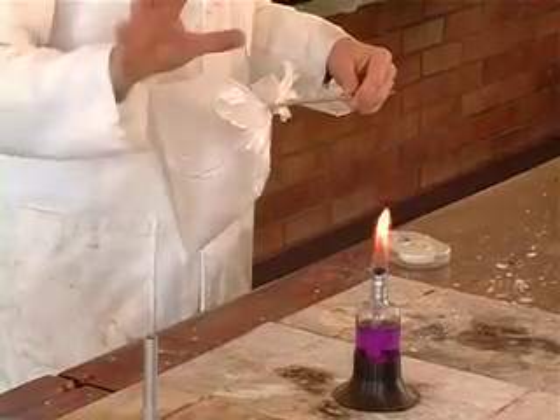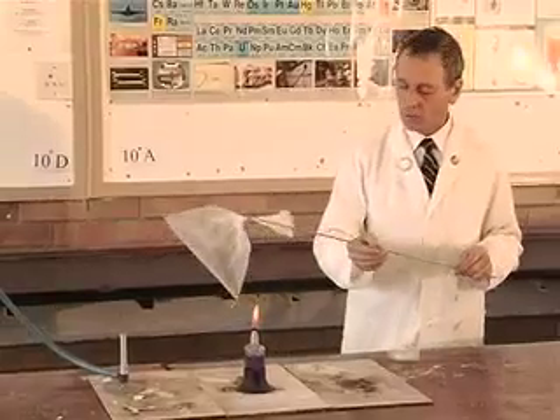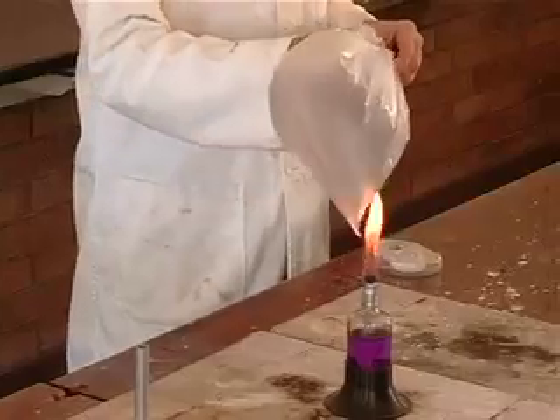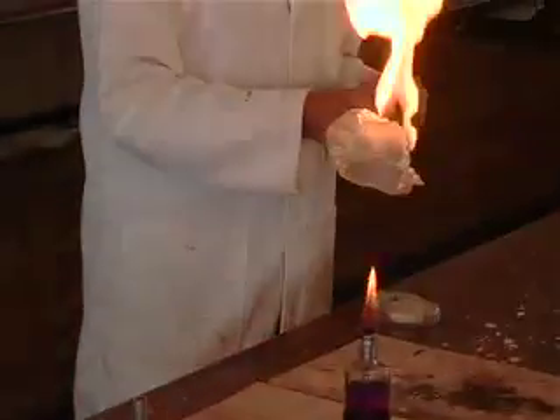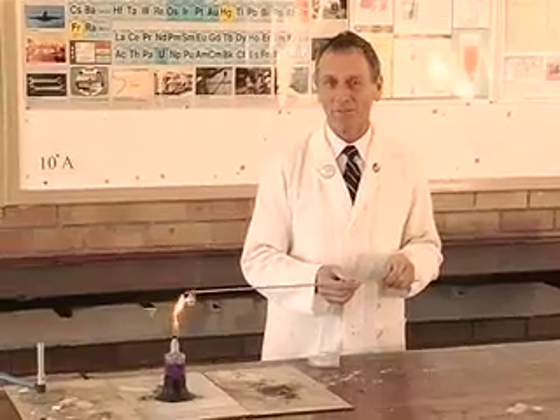The plastic will catch the light and then we'll get a little fireball as the gas itself catches the light and we see the exothermic reaction — no explosion, just a fireball and an exothermic reaction.